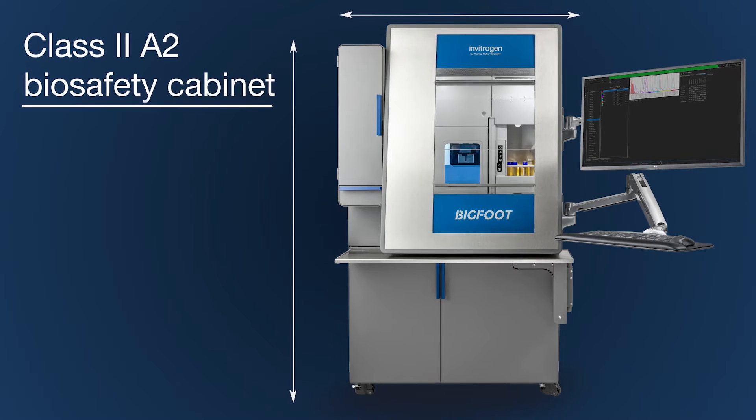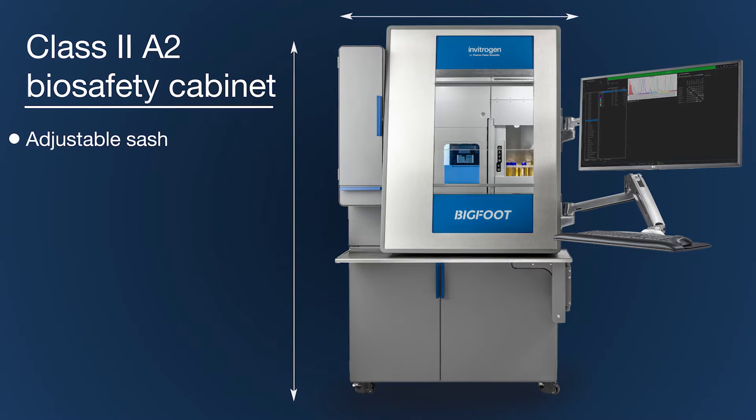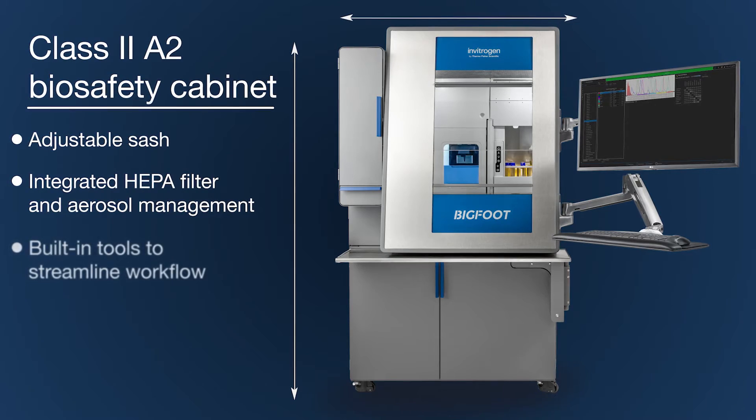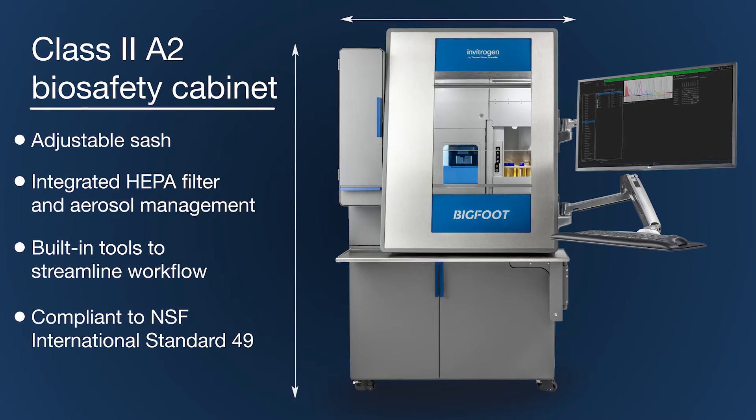The InvitraGen Bigfoot Spectral Cell Sorter with Sasquatch software features an integrated custom designed biosafety cabinet which helps ensure the safety of users and samples and is ergonomically optimized for sorting workflows.